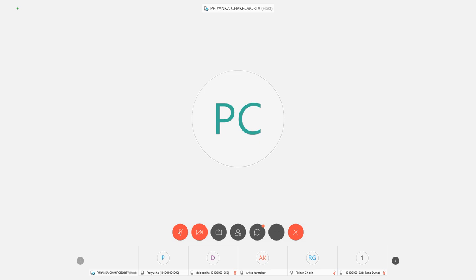Surface tension, viscosity, acid-base titration. These 3 labs have been done in your university. Yes ma'am. You are conducting classes for both the batches, right? Yes ma'am. Okay. So this is the fourth one.